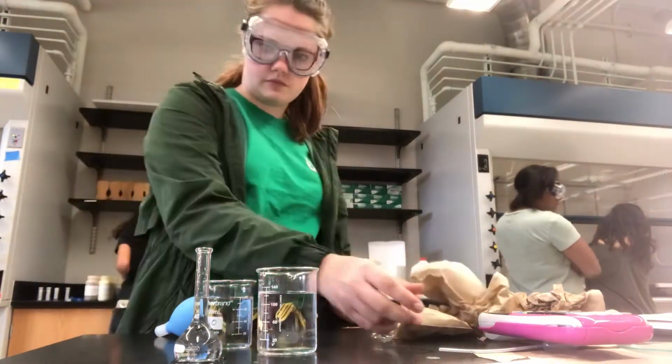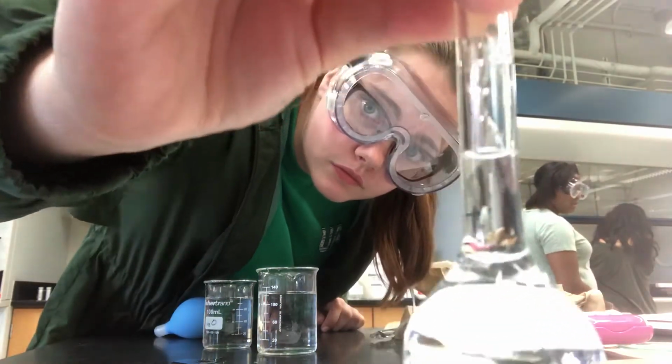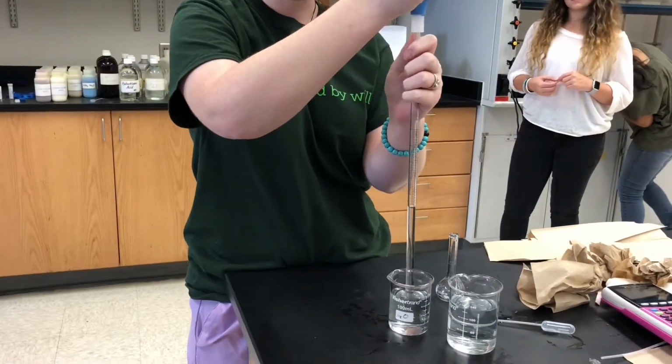The volume of the stock solution used is simply the initial volume of the pipette minus the final volume of the pipette. Then water is added to the flask using a transfer pipette to the final volume of 25 milliliters as marked on the flask.